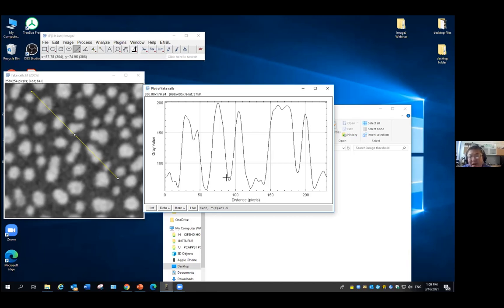Here I may say maybe the intensity can be a good one. Maybe I will say about 100. Everything down here is the background. The intensity of most of them is below 100. And if it belongs to a cell, it should be above 100. So I can use one parameter, based on the intensity, which I will call thresholding.